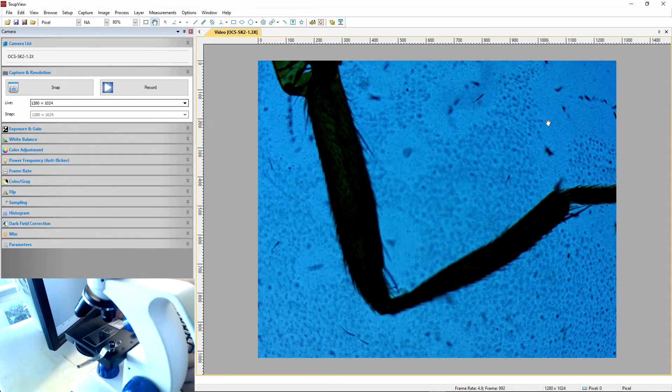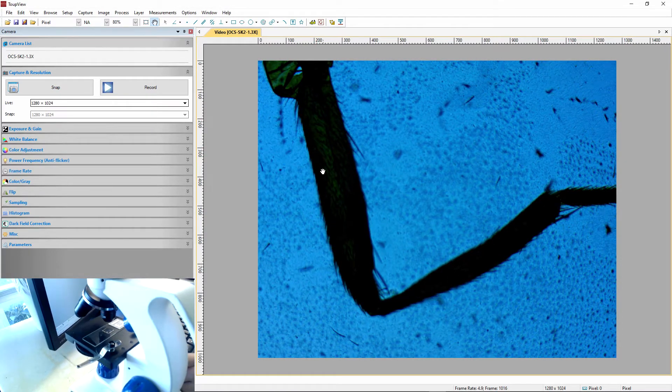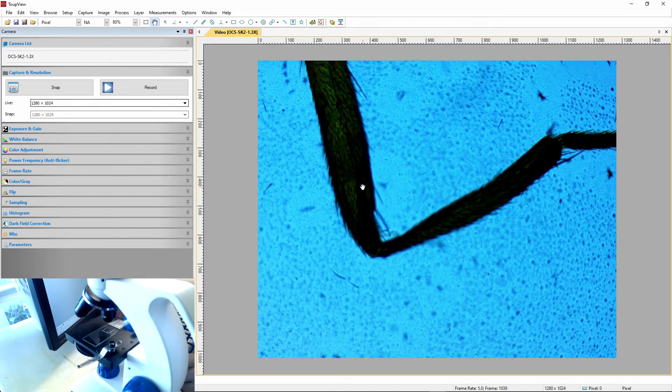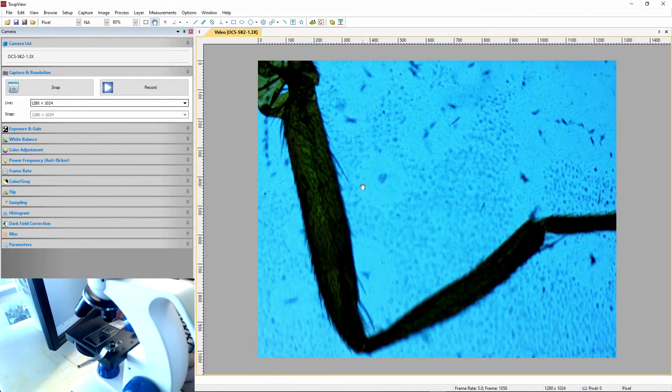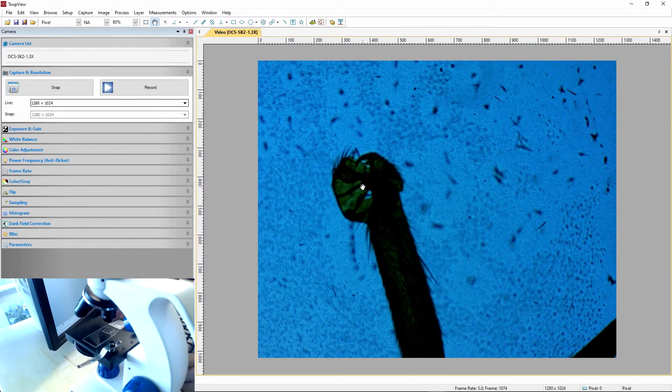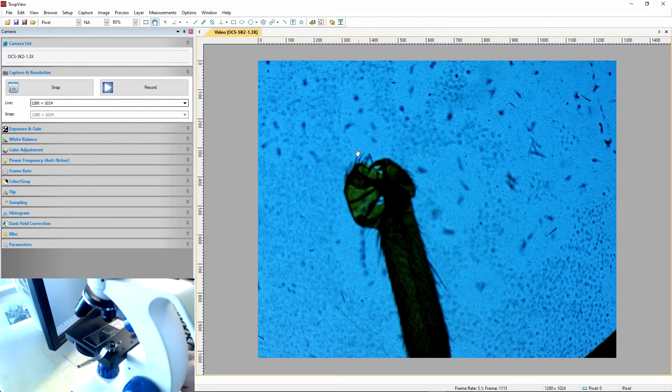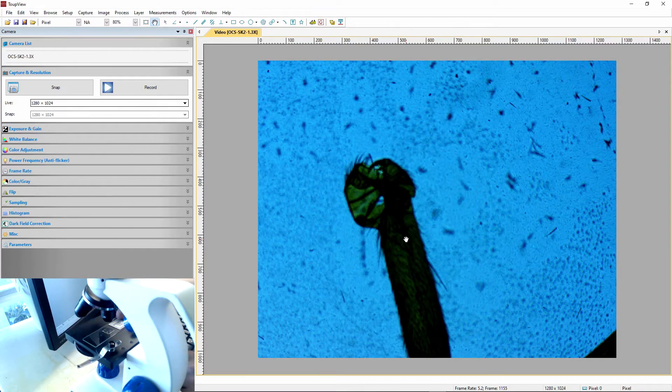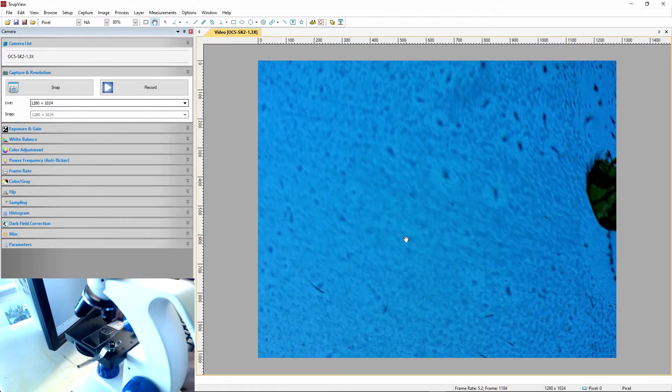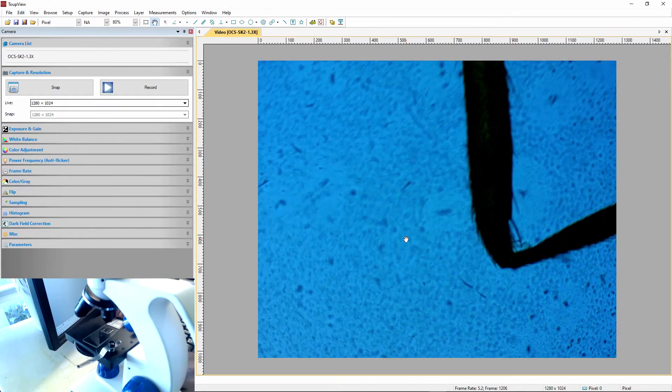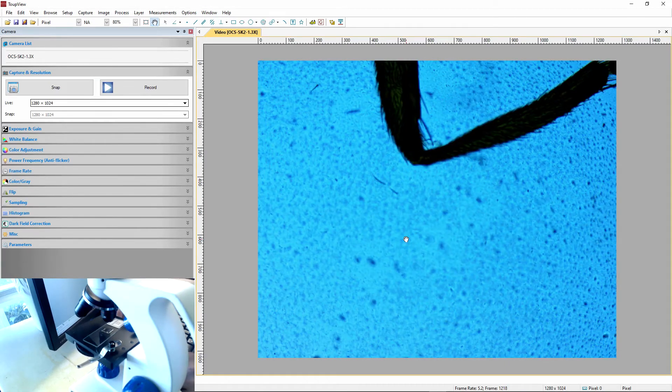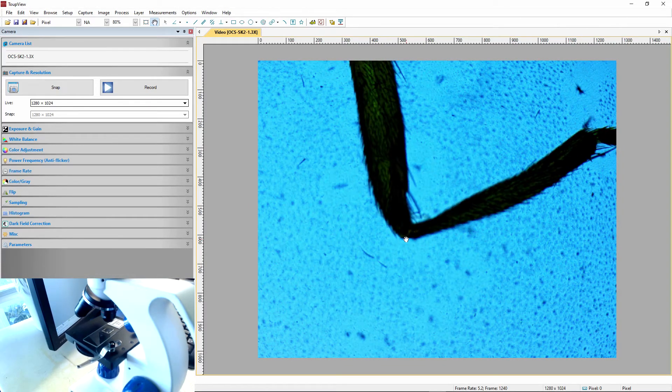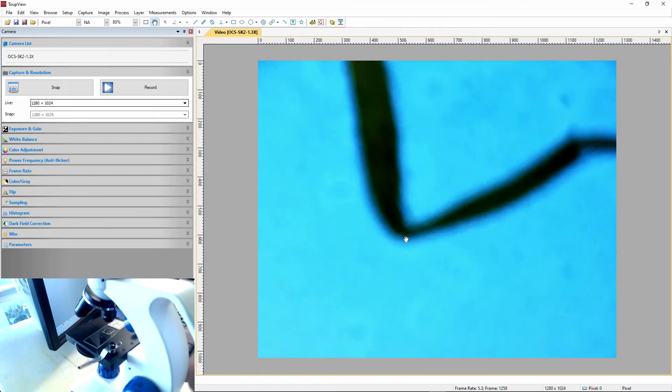Scroll down. Here's the bigger part. All that. Muscly. Thick. One way. It's really hard because all the picture is inverted. There we go. You can see this is where it was attached to the fly. All the hair. I might be able to... If I can line this up, we might be able to zoom in further. Look at that. Oh. Oh. Sneeze. Okay.